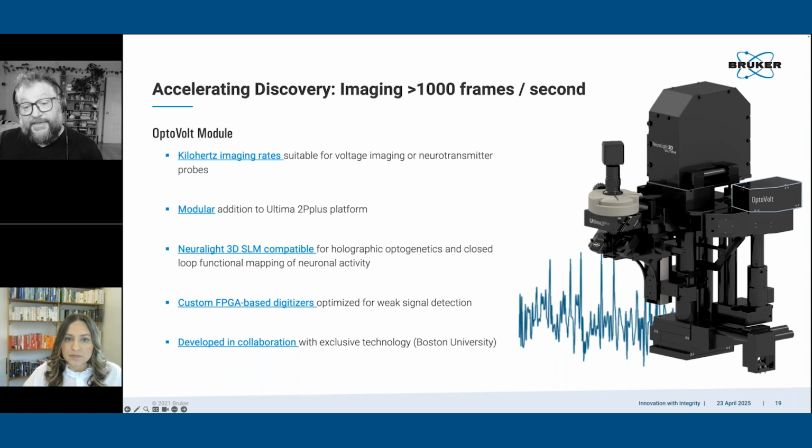Like, you can actually see the rebound. I am poor in the amount of data that I have right now, so I haven't really reached the point where I've been able to do a lot of averaging across different spikes to see a good waveform. But my guess is that it would be good enough in broader spiking neurons right now.